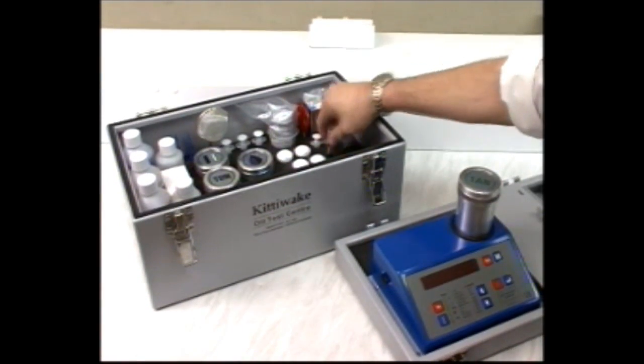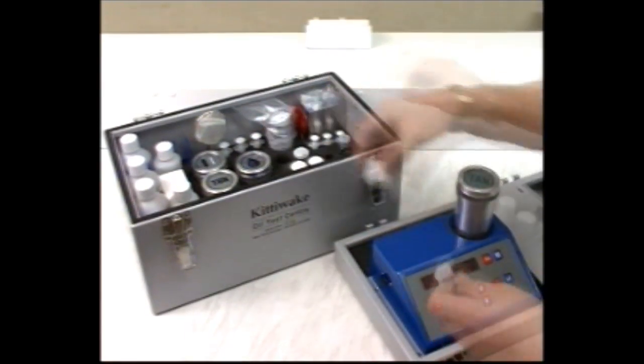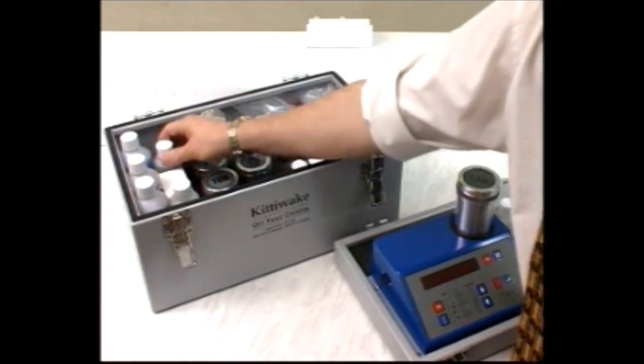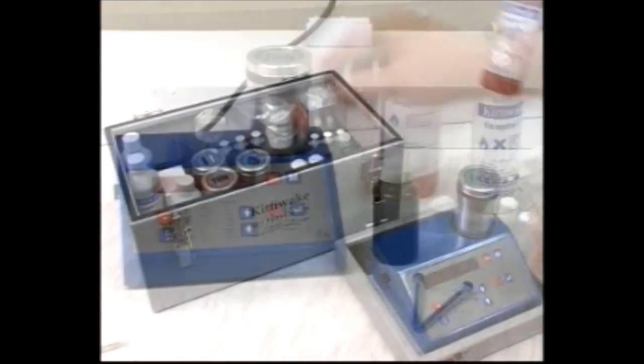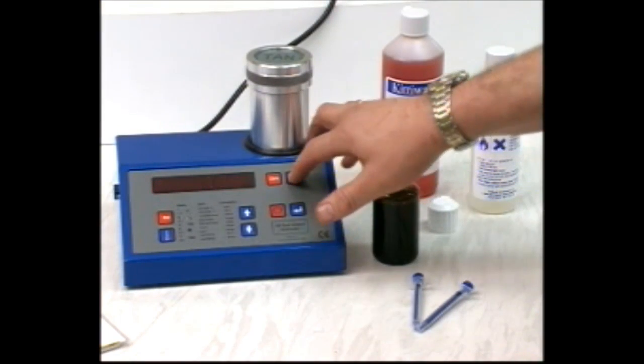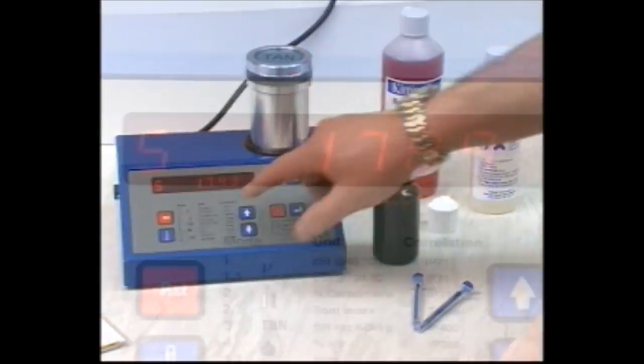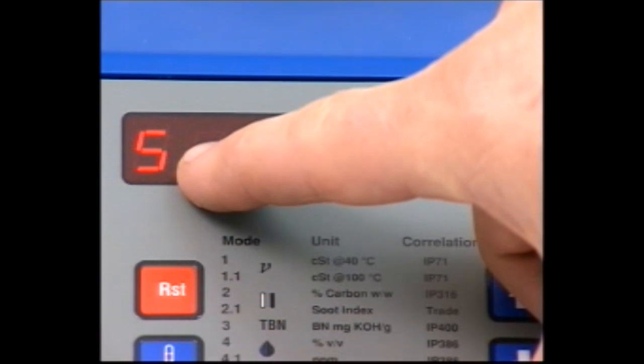This section shows how to measure the total acid number of a sample. Two modes are available on the unit. Use mode 5 for all mineral oils.